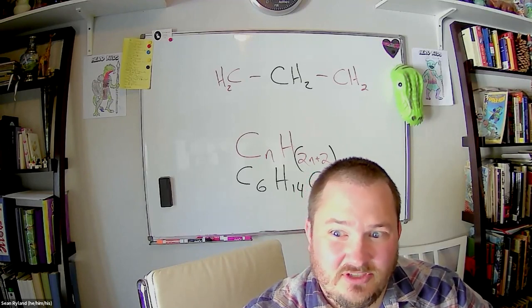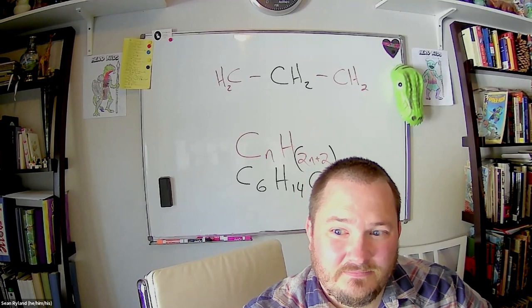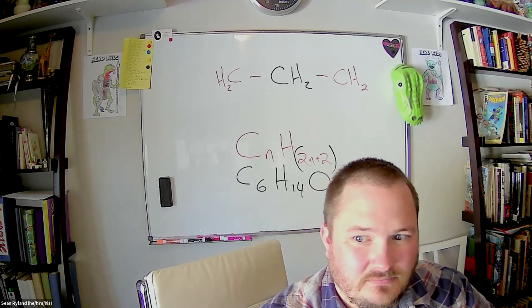See if that gives you something to work with. Sounds like you're approaching it the right way, Casey. Hey, you had a good start too. I appreciate it, man. That would make sense that it was a primary alcohol because the proton NMR with the two would be closer to the electronegative oxygen. So yeah, man, I think you're right about that one. That's what I was thinking, at least.